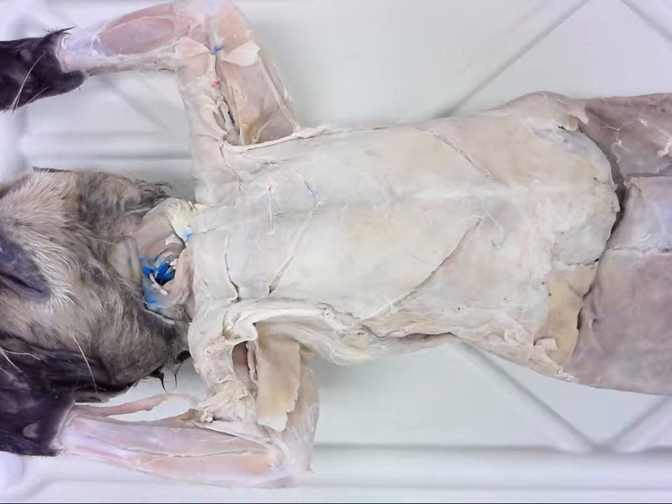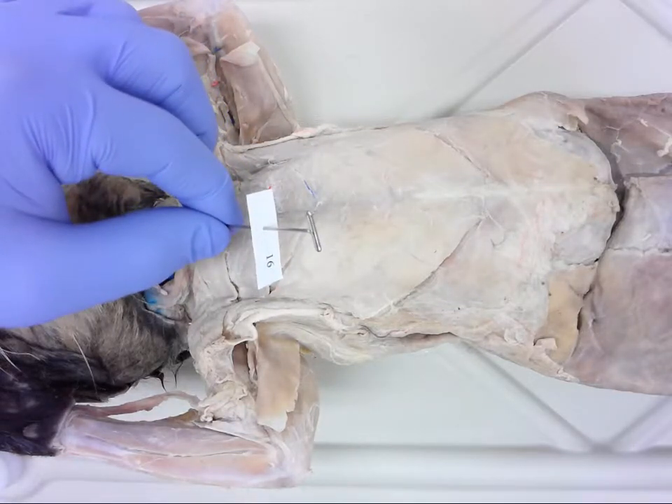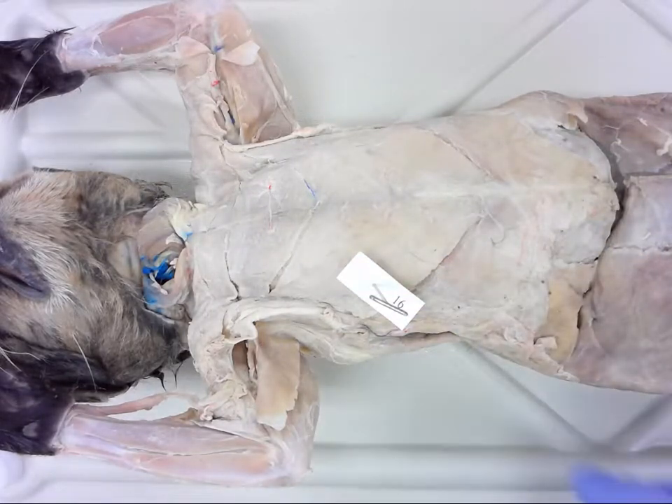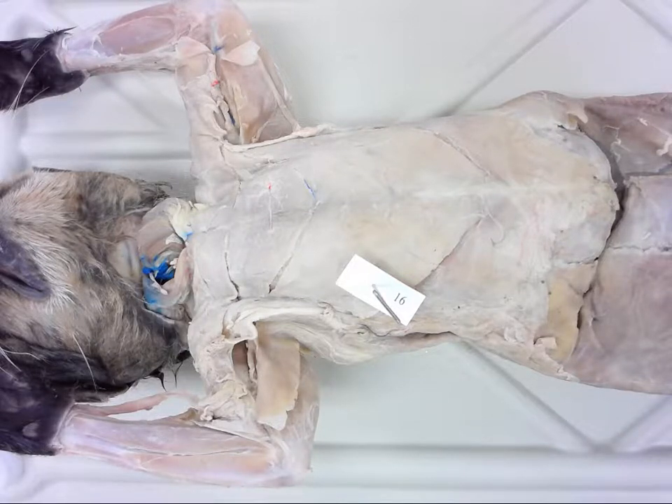So just to give you an idea of the lab final and what you should expect: when you come in there will be a number of specimens throughout the room and they will all be pinned with numbers. Here is a typical t-pin with the number on it, and it would be placed anywhere throughout the specimen — I'm going to throw this here into the pectoralis minor. The structure I'm looking for is the first thing that the pin goes through. There are going to be times where I may have to anchor it to something else, but look at the first thing the pin is inserted through. Secondly, it's going to be important for you to be as descriptive as possible — make sure you're using things like right and left, using full terms and not abbreviating, so it gives me a better idea of what you are trying to explain when I'm grading them.